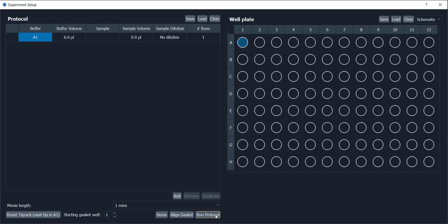The software will ask you where to save the results and perform a series of tests, after which the users will be notified if any of the requirements to run the protocol are not met. If the protocol was aborted by pressing the Stop button on the AcquireMP, the Home button can be used to position the arm of the robot back to the resting position.